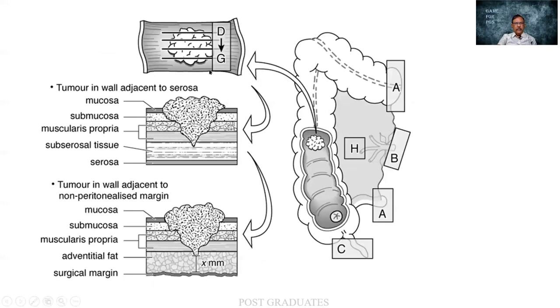And this is one. You find that if this is going to be a tumor, again, longitudinal bits are taken. The logic is very simple. We say that there is a mucosa, submucosa, inner circular, outer longitudinal muscle. If I am going to give a bit in this direction, it will be changing the histology. It will become inner circular or inner longitudinal and then outer circular. In order to avoid that and to maintain the histology, it has to be this. Dictums are dictums, do not change.